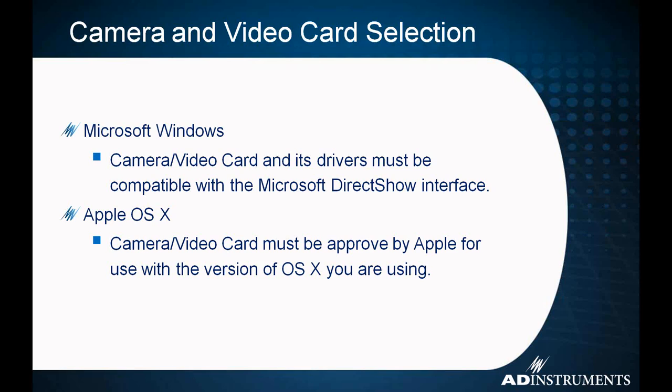Same thing with Apple OS X. Make sure that the camera or video card that you're getting for the capture module in our Mac software is approved by Apple for use with the version of OS X you are using.